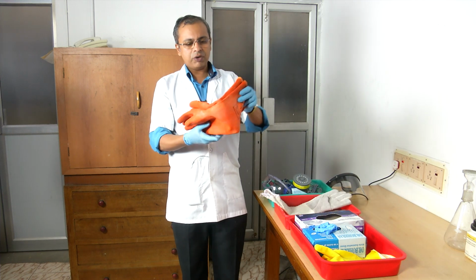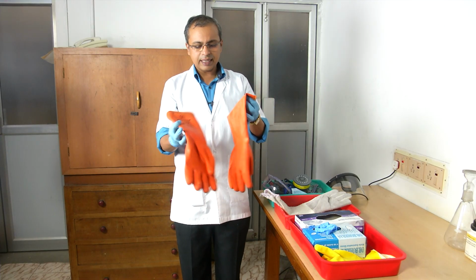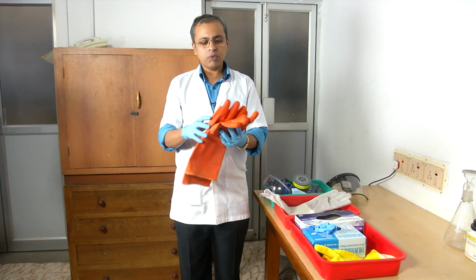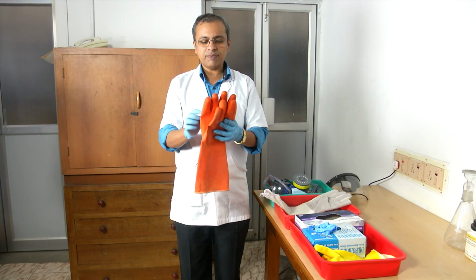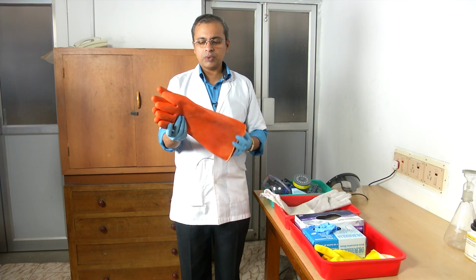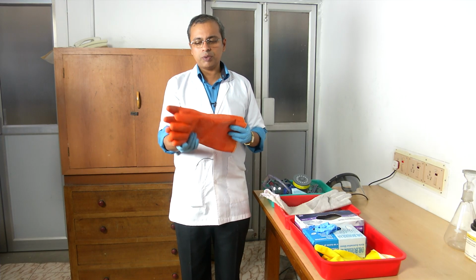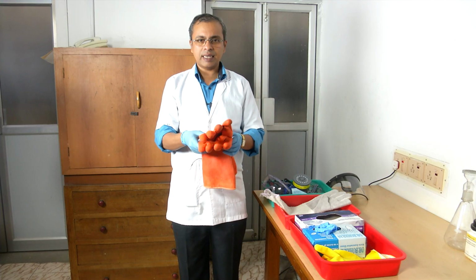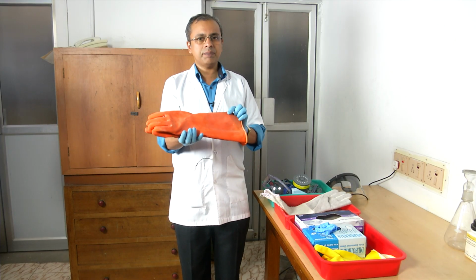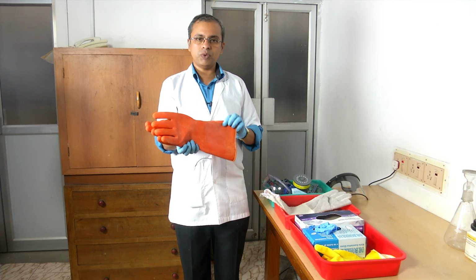This is another pair of gloves which I wanted to show you. These are specifically meant for handling acids; they are more resistant to acids. So, if you are working with acids, then these may be better gloves to have so that you can handle them in a safe manner, because you do not want anything spilling on your hand and damaging your hand very badly, severely. So, these are simple safety devices to help you in that case.